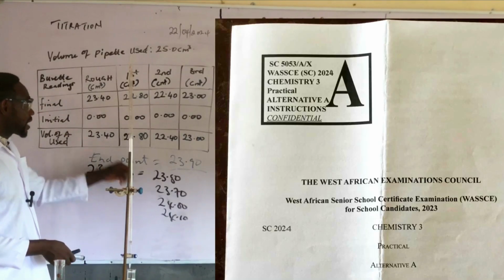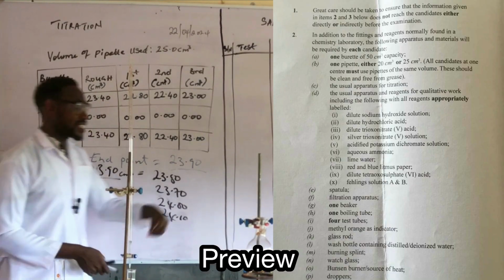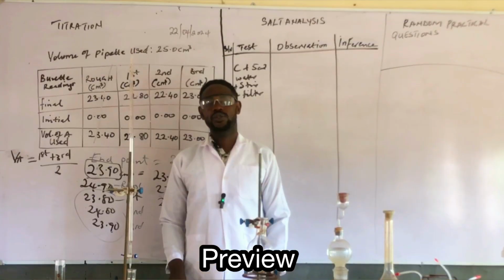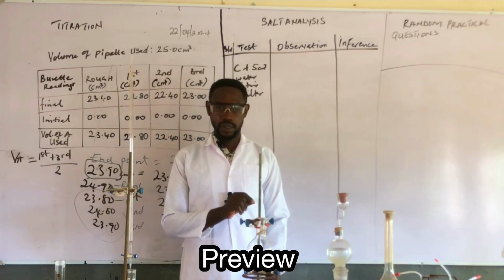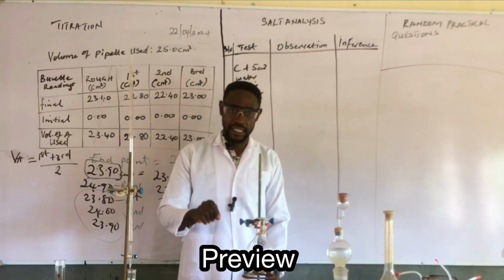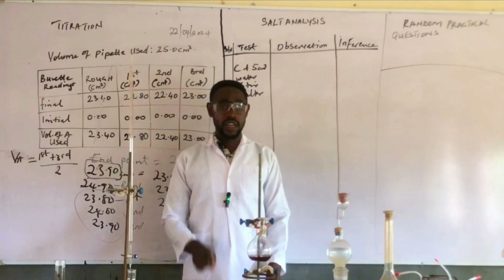I'll teach you exactly how you manipulate this table, immediately you hear your teacher's endpoint, your table is sure. Then how to fill your report form for teachers. You will be given an instruction paper, teacher's instruction, what to provide. And on the exam day, you will be given also the report.